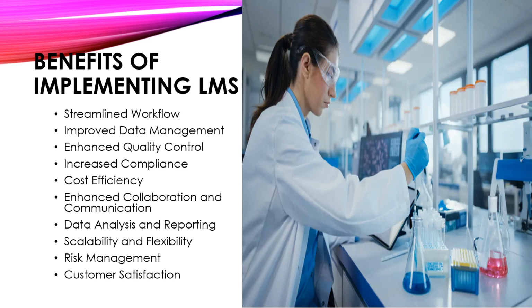Data analysis and reporting. A laboratory management system typically includes advanced data analysis and reporting capabilities, allowing laboratories to generate customized results, trend analysis, and graphical representations of data. And this enables better decision-making, trend identification, and insights generation from the collected data. Scalability and flexibility.